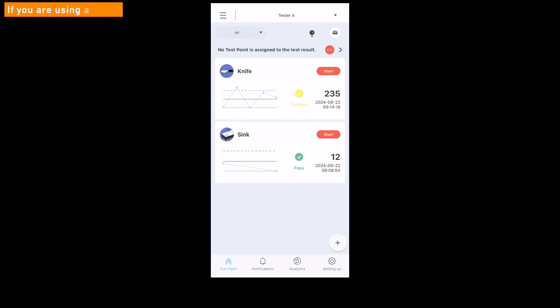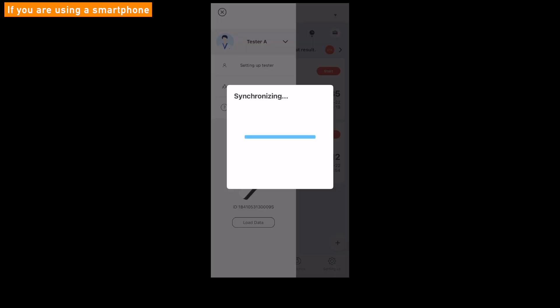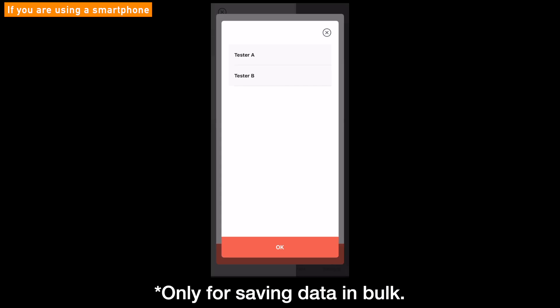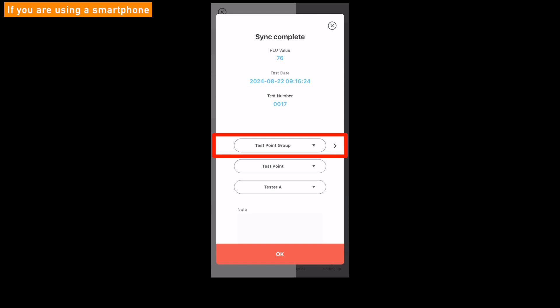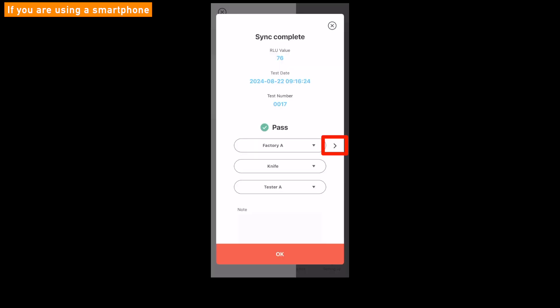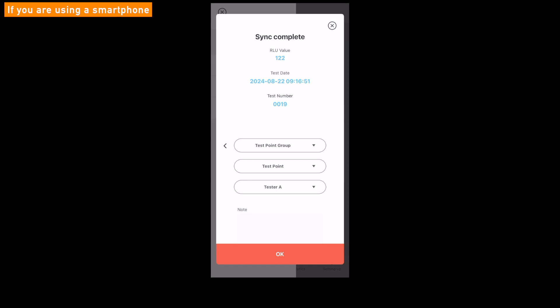It is also possible to test without connecting the Lumetester smart to the app and save the results later on a smartphone device. Tap Load Data in the lower left corner of the screen while the Lumetester smart is connected to the app. If you want to set the same tester information to the loaded results in a batch bulk, click or tap here and select a tester. Tap or click the OK button; the screen will change to Sync Complete. Please set test point group and test point to each data, and click the arrow symbol to check the next result. When you have finished entering the results, click or tap the OK button to complete saving results.